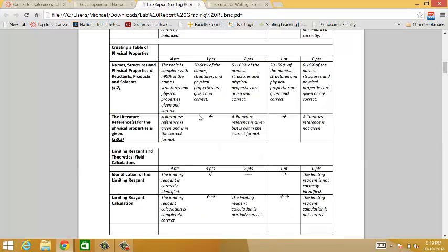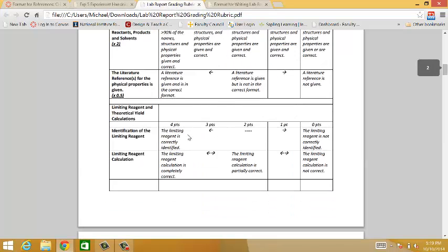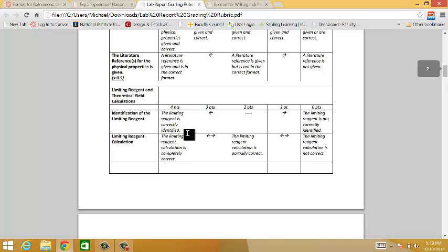Well, the theoretical yield in this case, I totally made it up. I have no idea what the theoretical yield should be, how much eugenol and eugenol acetate you should expect from 2.5 grams. I know that's shocking, but I've been using this estimate for the last 15 years. So it said that you would be able to obtain 50% of 20%. So overall, that's 10% of 2.5 grams, which is 0.25.